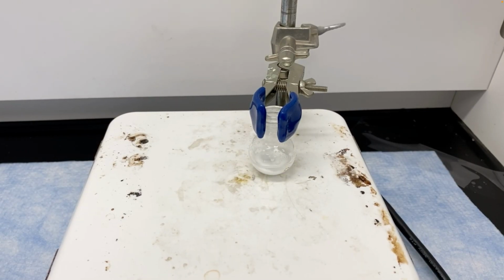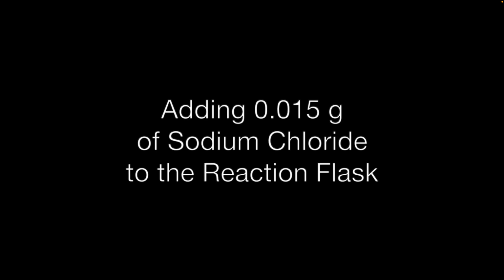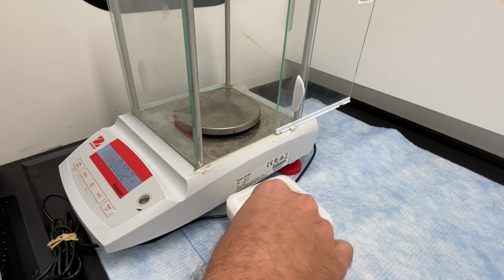Notice the stem of this funnel is thinner. And then you'll just let that react for 50 minutes. Make sure you're stirring it that whole time. You want to stir it vigorously, but not so much that it's splattering everywhere. After around 50 minutes, we're going to add just a little bit more sodium chloride, just to make sure the reaction goes to completion.